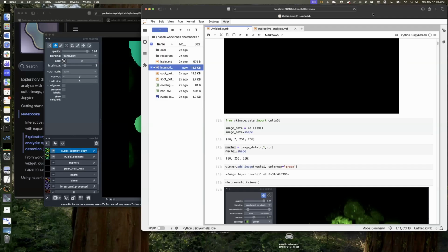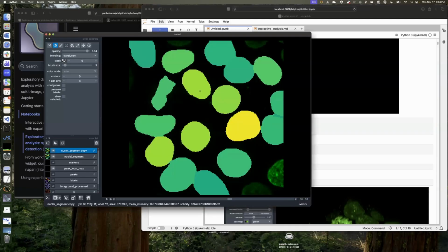But at the end of the day, if you want to write someone a letter, an email, or a publication, you're going to use more or less similar things in different ways to get the same outputs. So I think the two are very similar in some ways, but very different because you don't have all the windows. One of the things I never liked about Fiji was that you would have so many different windows. If you tried to do something like this, you'd have like 15 windows floating all around your screen.